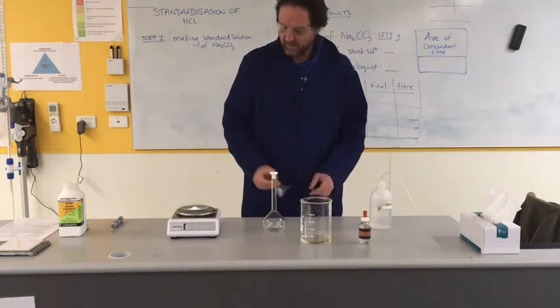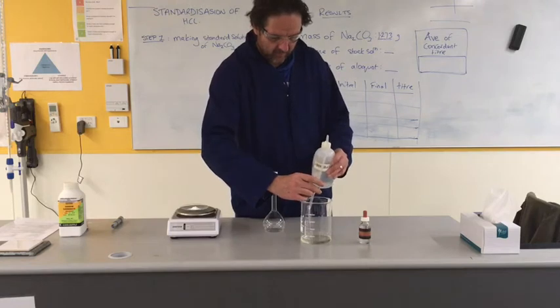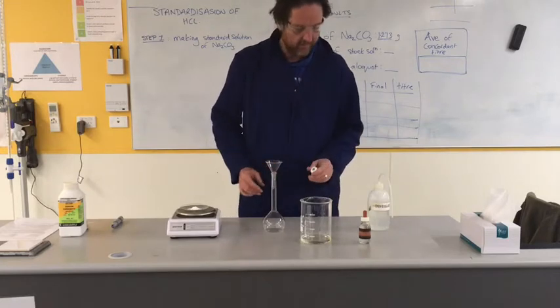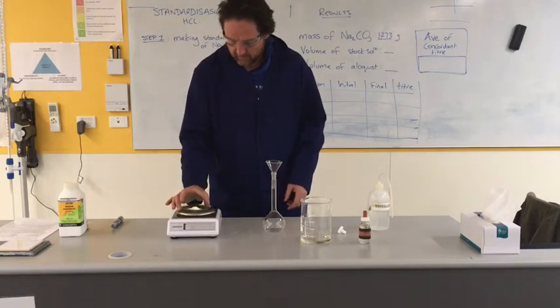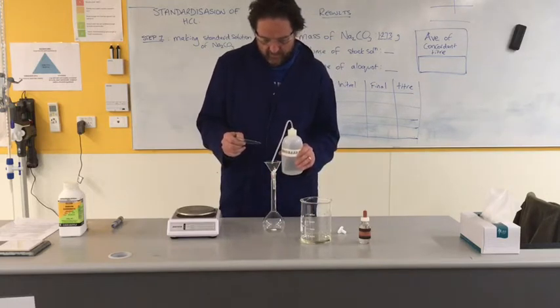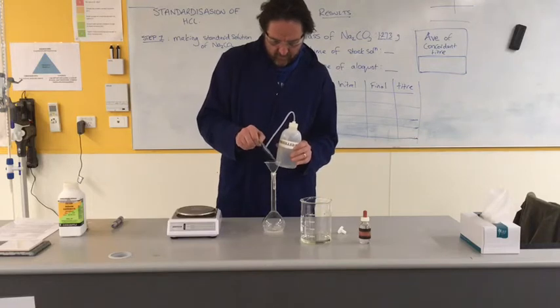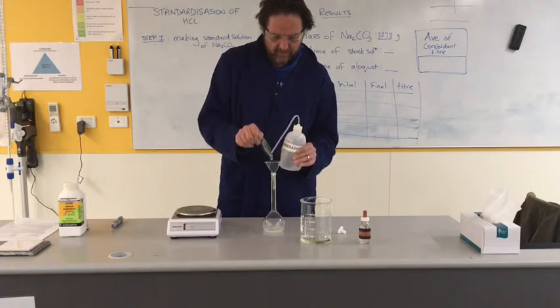Because I'm going to use a funnel to get that into there, I'm going to rinse the funnel down a little bit - swirl around on all the surfaces. Distilled water. If I get drips of distilled water in there, it doesn't matter. Now I'm going to do my best to transfer all of that into there. There's a little bit left on the surface - try and squirt down as much of this as I can. I hope you're thinking about errors - remember this is all about precision and accuracy. Are there any places I might be losing accuracy?